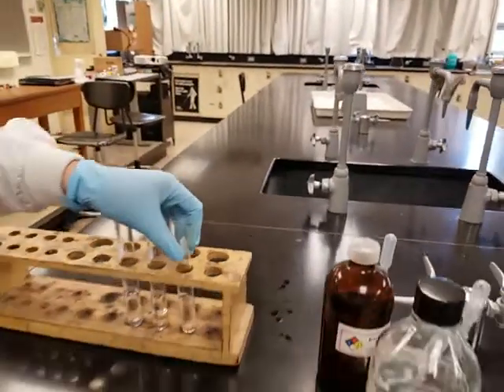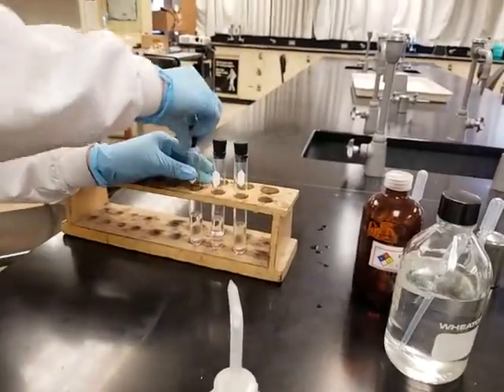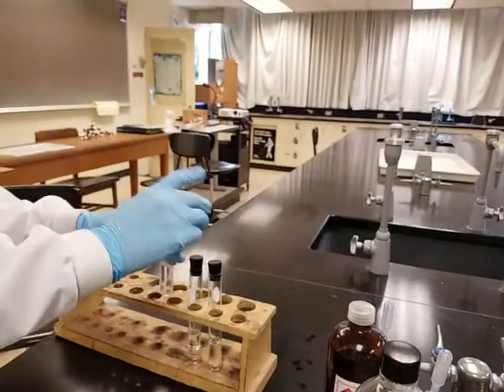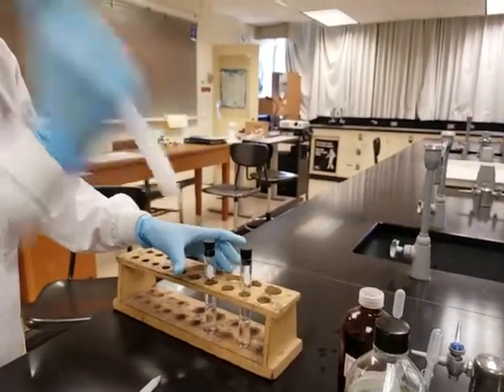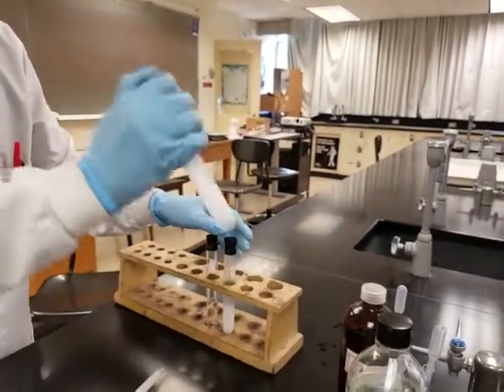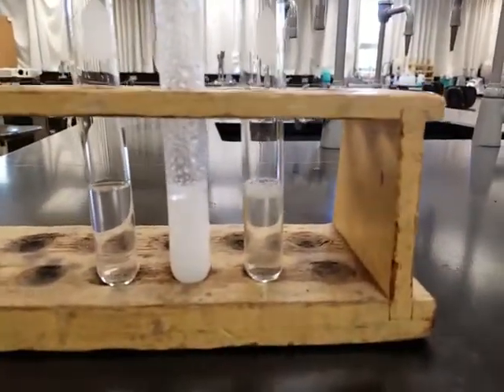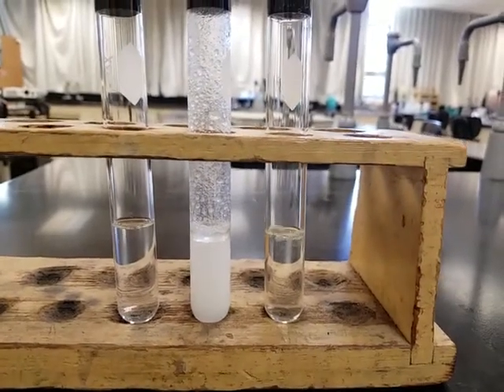Now we're ready to cap them up and give all 3 of them a good shake. Here's test tube number 1. We're going to give it a good shake. Test tube number 2. Give it a chance to shake really well. And then test tube number 3, the same way. Give it a good chance to let the liquids interact with each other. And now let's observe this for 1 full minute.